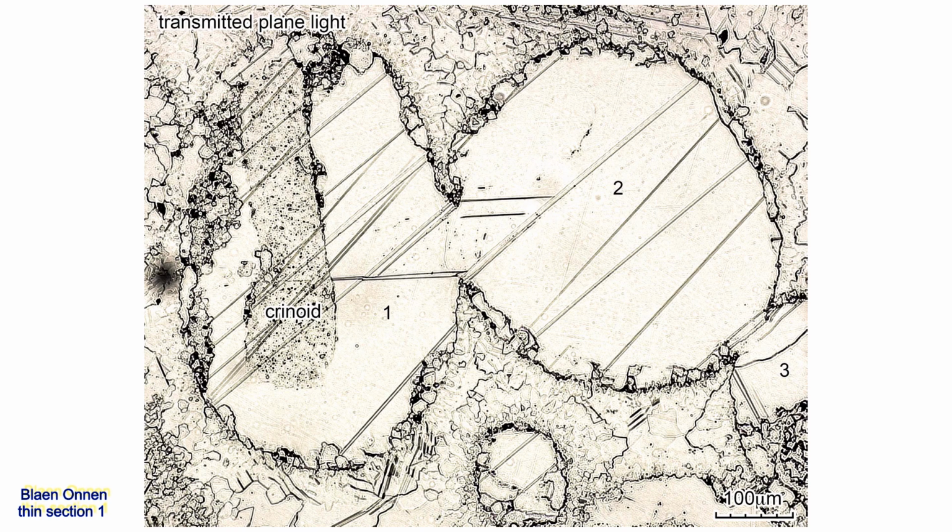At deposition, ooids rest on one another at point contacts, but the margins of these 3 numbered grains overlap one another, indicating minor compaction occurred before their cortices were dissolved. This dissolution only affected the ooid cortices. It did not affect some ooids' skeletal nuclei or their surrounding calcite cement that preserves the ooid's shapes.